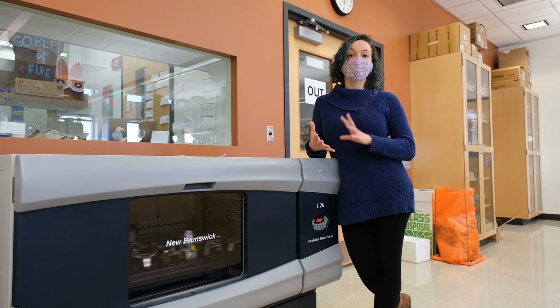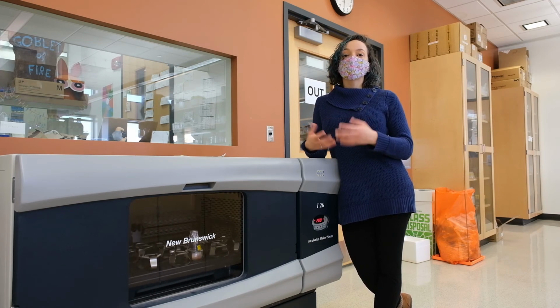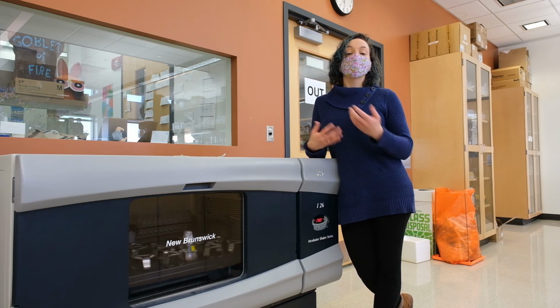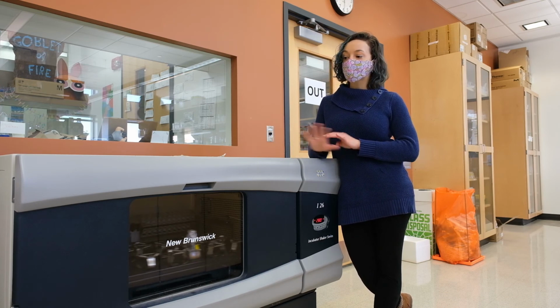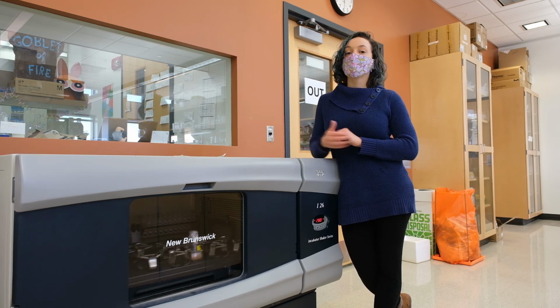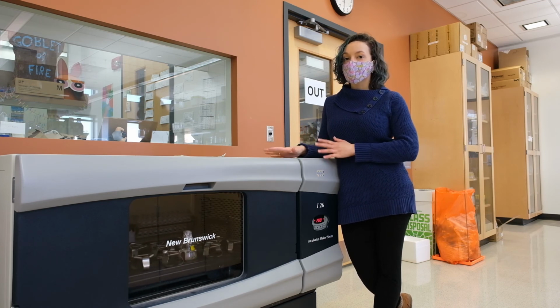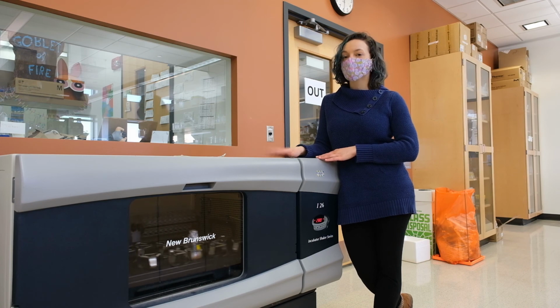To avoid compromising your metabolomic samples, do your metabolite extractions in the same conditions that you're growing your cells in to test. So in the warm room or in the anaerobic chamber, if that's where your cells are growing. If that's not possible, like in the case of a shaker like this, then we recommend setting up your workstation for metabolite extraction as close to the incubator as possible and removing cultures one at a time to do the extractions. That's all for today.